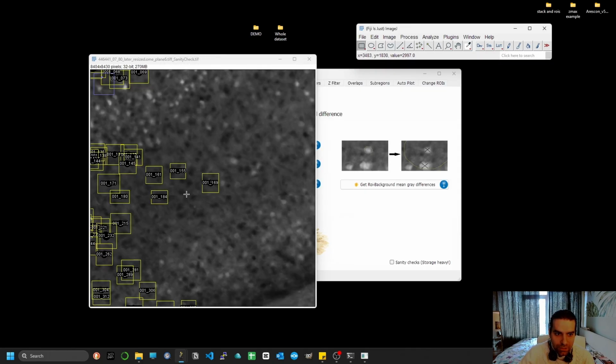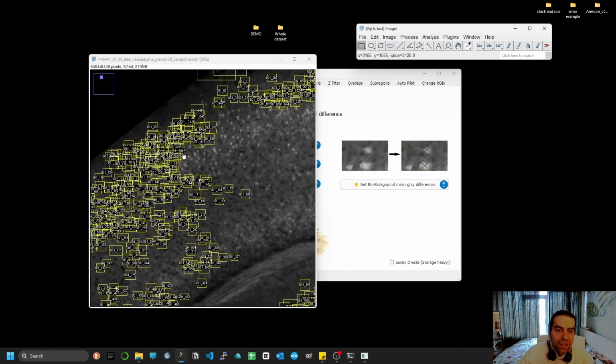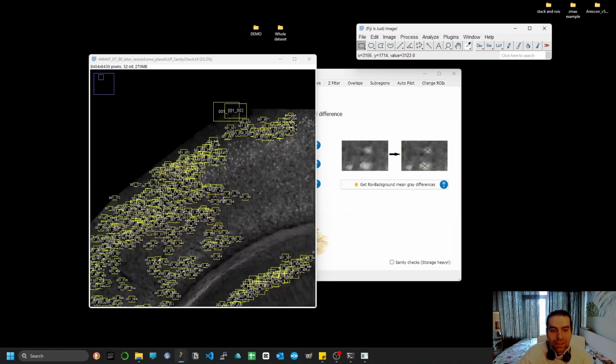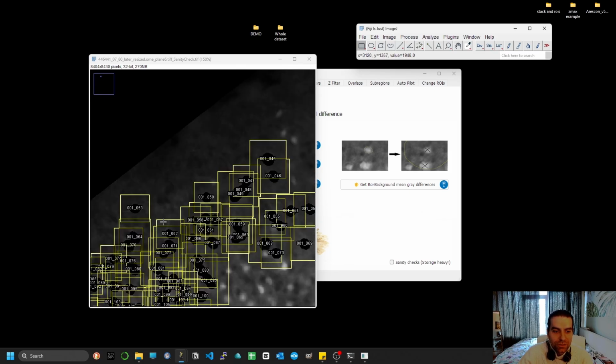And remember, one of the reasons that we wanted this is that when you're taking the surrounding background, you don't want your region of interest to also have values, and when you have adjacent cells, you don't want this to impact the surrounding background of this. And this is the convex hull that I told you about, right?